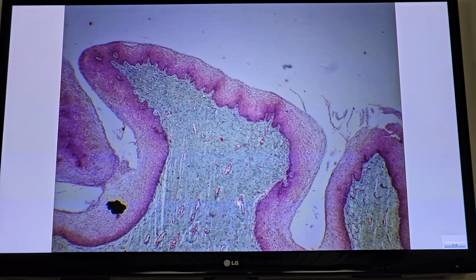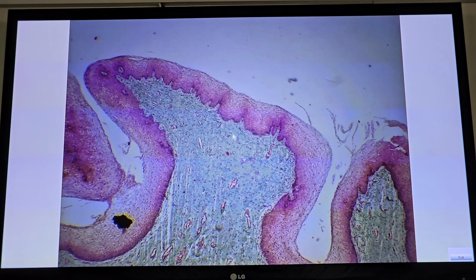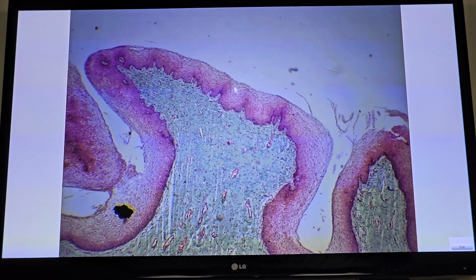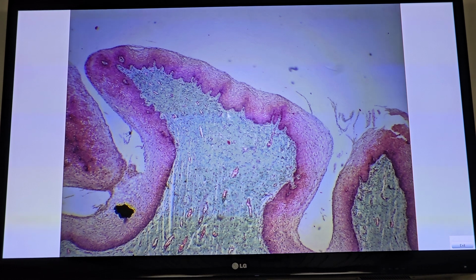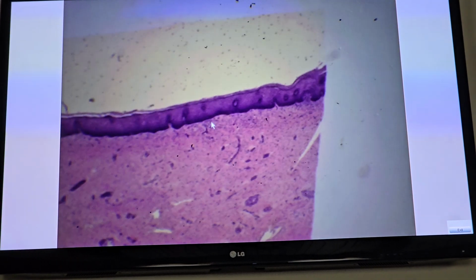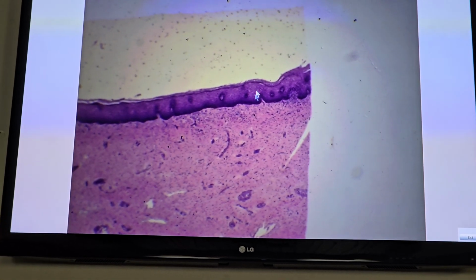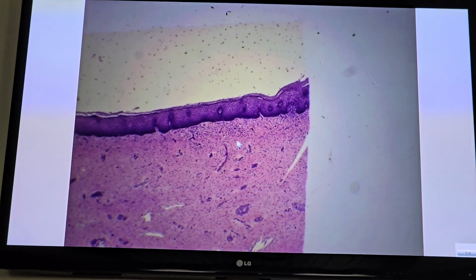Did you notice the color is different? Trichrome stain. Section in vagina. The main characteristic feature, stratified squamous, non-keratinized. This is trichrome stain. We have another section of vagina but stained by hematoxylin and eosin. Stratified squamous, lamina propria, eosin and hematoxylin.